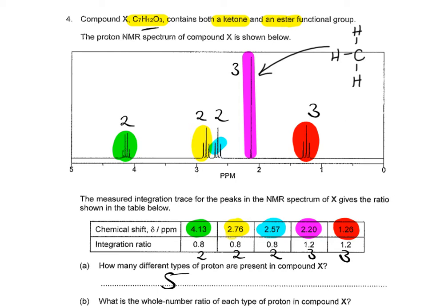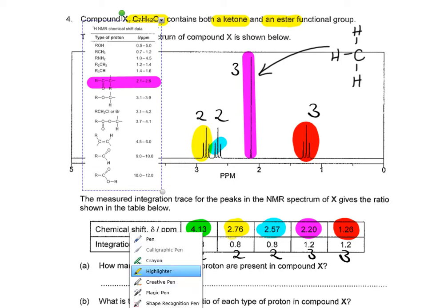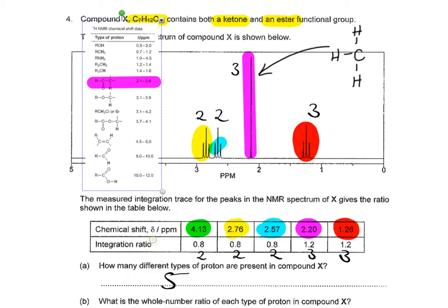If we look at its chemical shift, we would probably suggest that these are protons next door to a carbonyl group, and also the fact that we've got a single peak there, a singlet, means that we're expecting to have no neighbouring hydrogens.